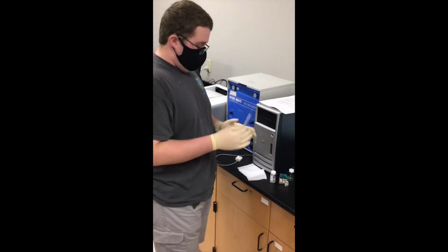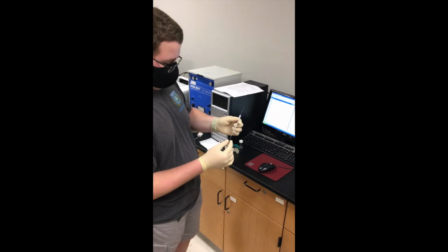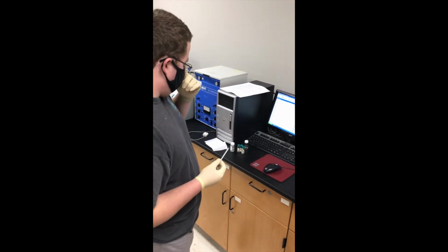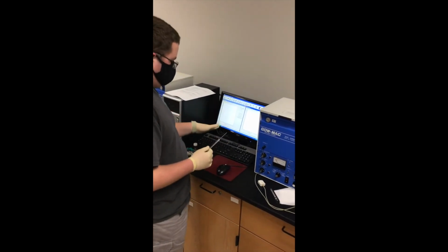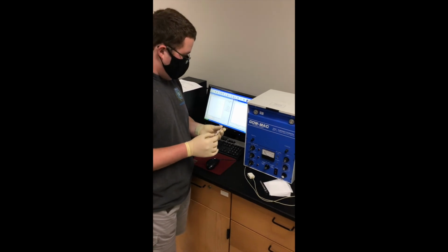So now, suppose that I've got my stuff ready to go. I have nothing in there for now, but you will have it, and it will look something like this with your liquid on the inside. And let's say that I'm ready to go ahead and run the GC. I'm going to use this one for the example, and I'll be running it to channel 2. So as normal, I check the baseline, zero the voltage, and then uncheck the baseline. And now let's suppose that I have this ready to go.